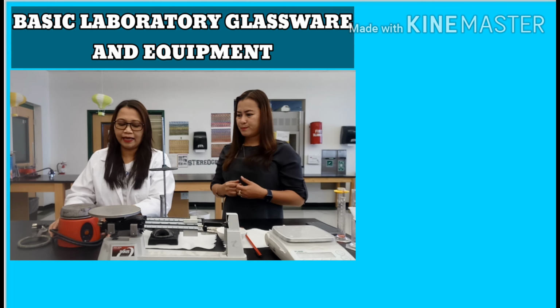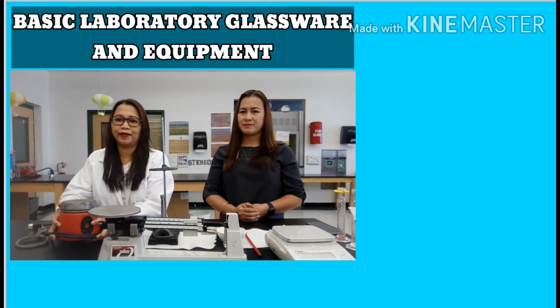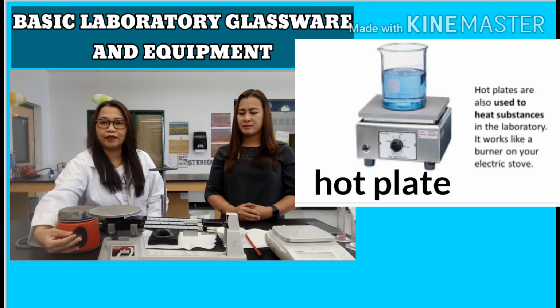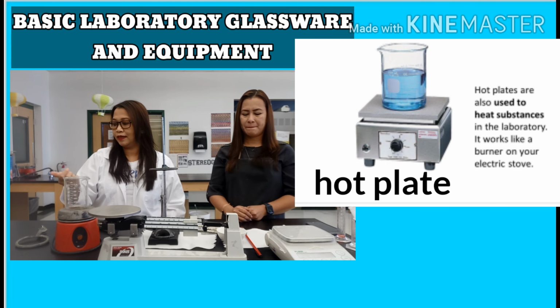All right, and then just in case you do not want to use the Bunsen burner, you can use the hot plate. This is the hot plate. So all you have to do is just plug in the cord, and then you have a switch here. You can turn it on, and then put a container, and then put a liquid that you want to heat, and there you go. You can actually have a hot substance.